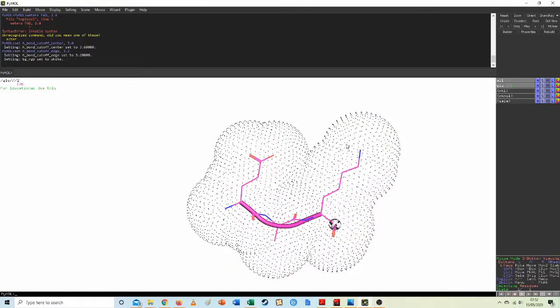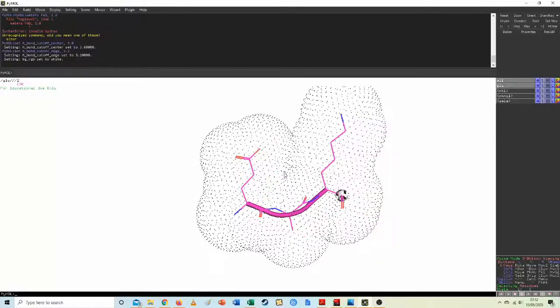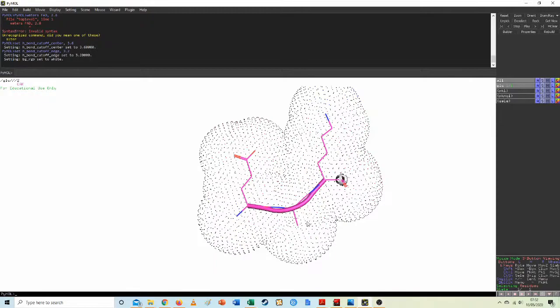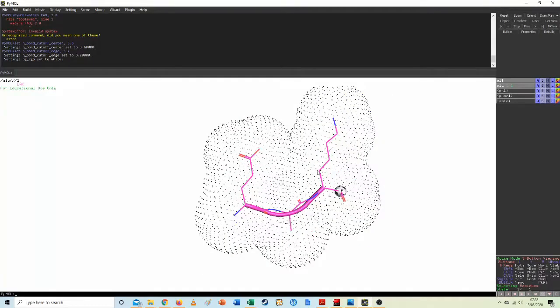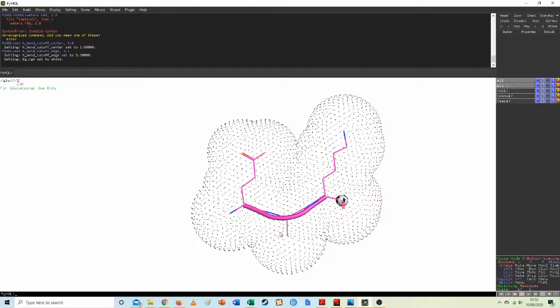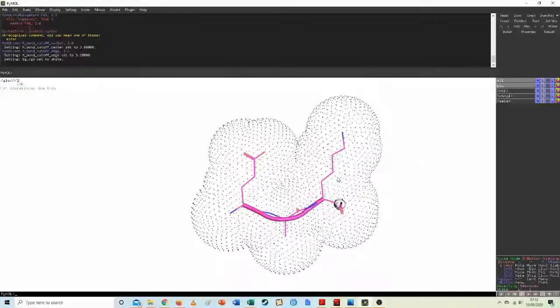And you can see what these 3 amino acids kind of look like. It also means that hydrophobic section, this, if you can see this little bit here, our CH3, is actually forced down because there's no space here for that to pop up. Even though it is hydrophobic, it's not going to find space between these 2 R groups of the glutamic acid and the lysine. It's going to be forced down the way.